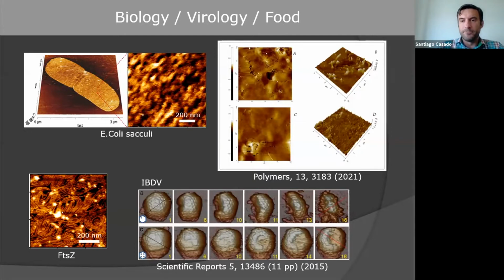By putting that protein on a flat surface, it forms these polymers. But it's amazing that the polymers do not stay in this shape. It's a dynamic combination. In the media there are FtsZ molecules, and they interchange with these polymers. So it is a dynamic polymerization. It's quite difficult to measure that with other techniques.